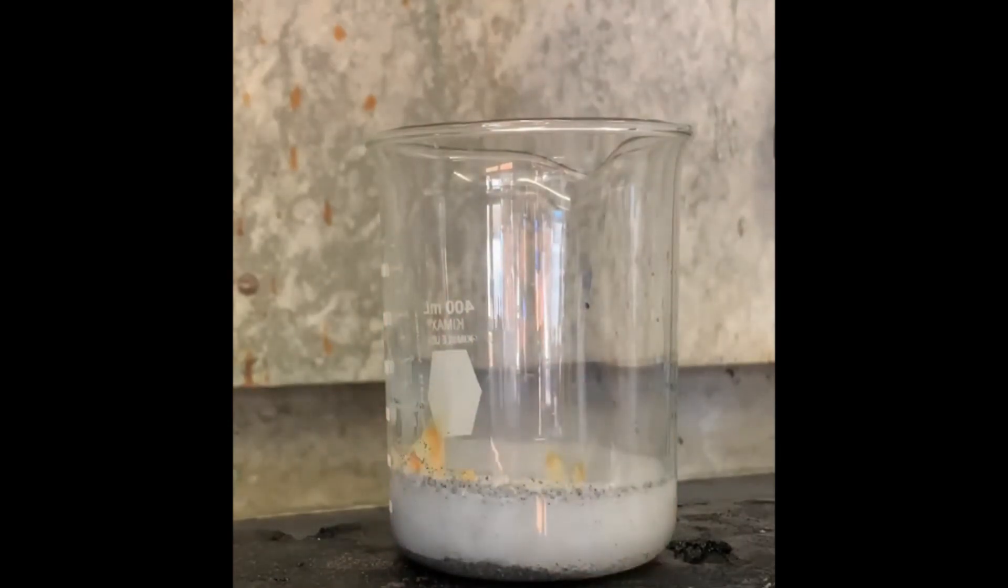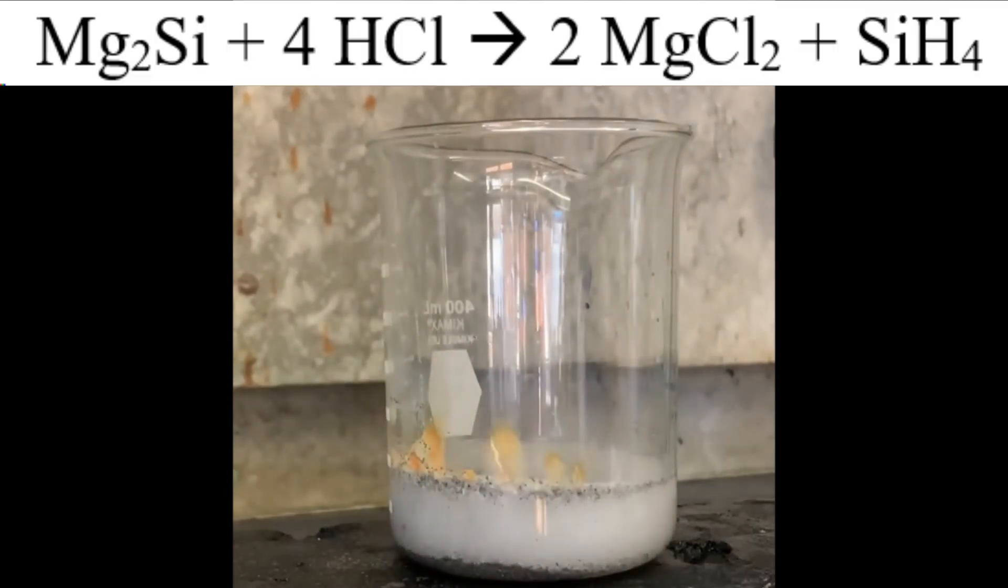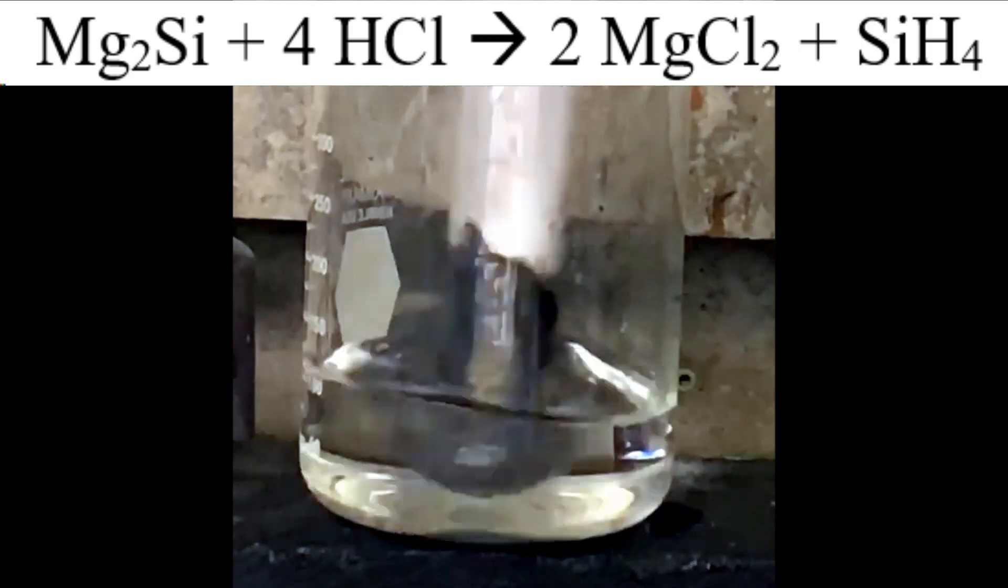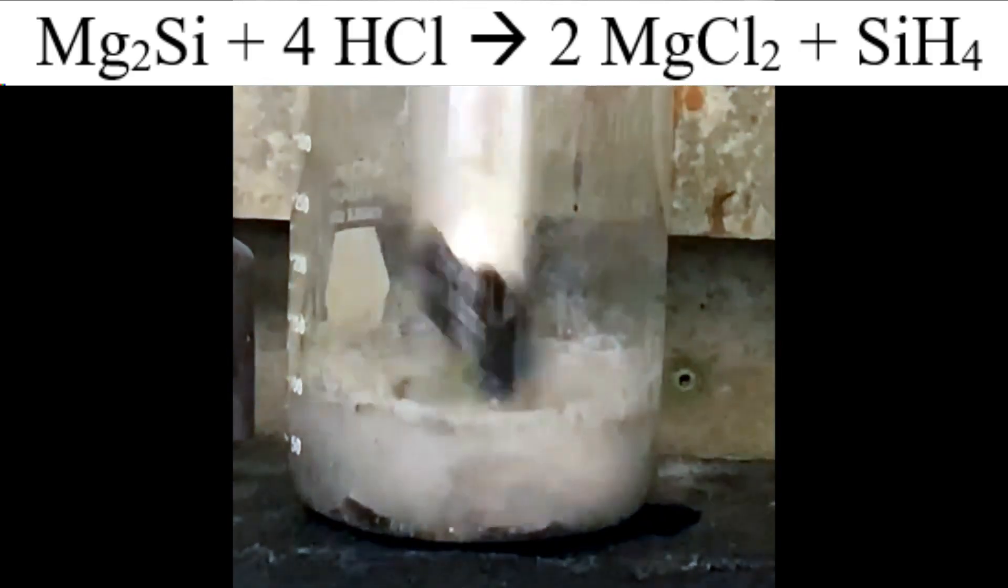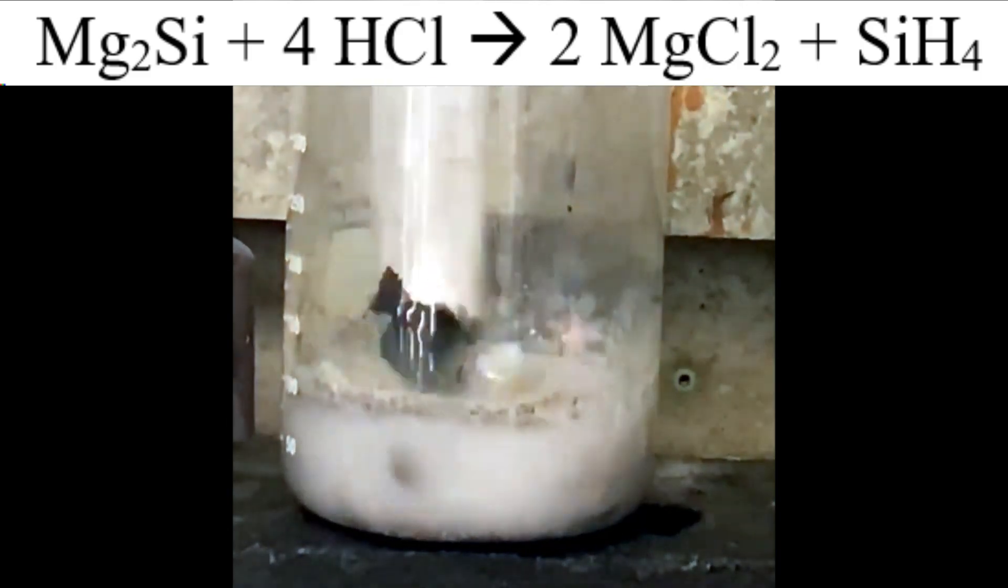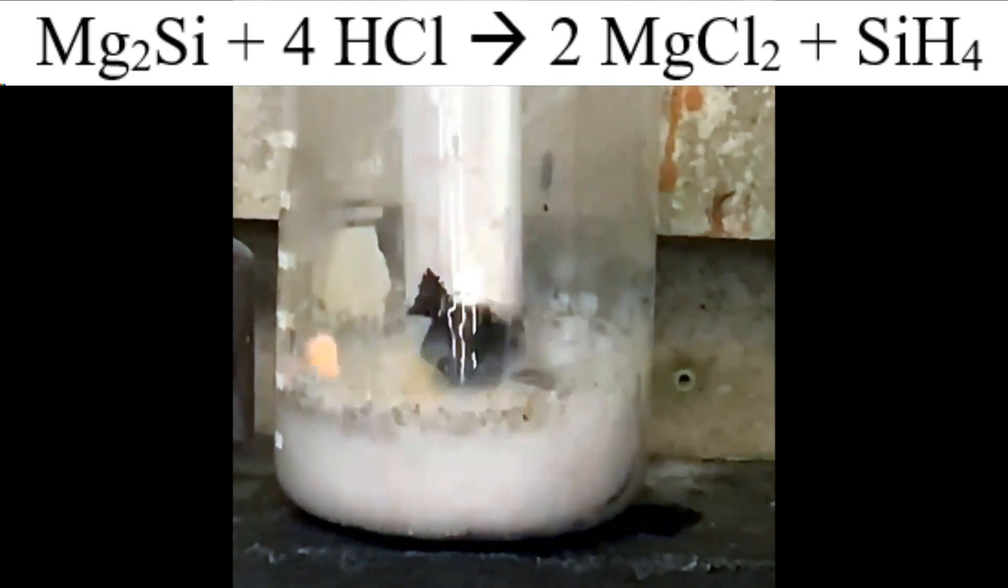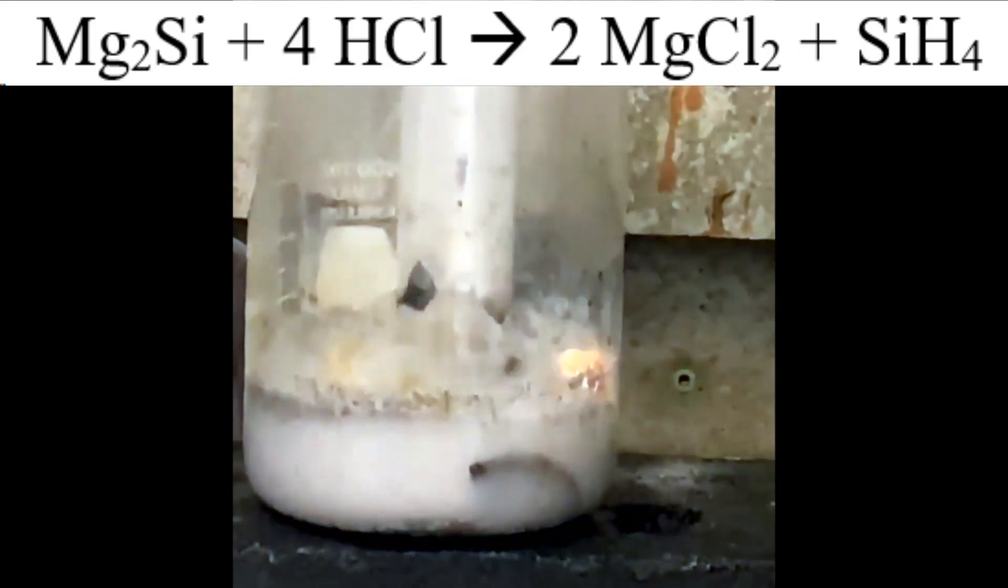What's going on here? Well, magnesium silicide reacts with the acid to form silane gas through the chemical reaction you see listed above. Silane gas, or SiH4, is the silicon-based analog to methane or natural gas. Just like methane, silane gas is flammable.